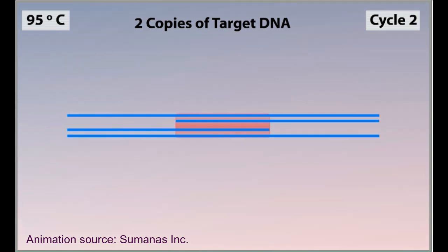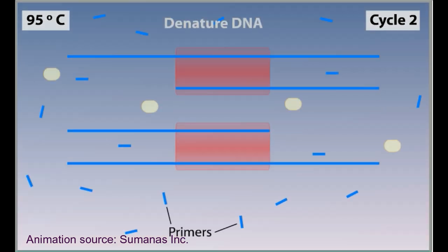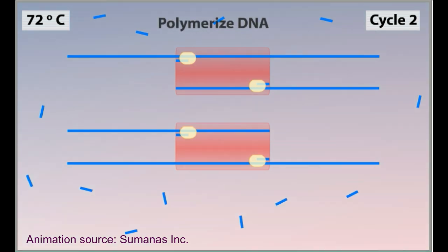The PCR reaction mixture contains mainly copies of the primers and an abundant supply of nucleotides to perform many additional cycles. After a second cycle, there are four copies of the target DNA produced.